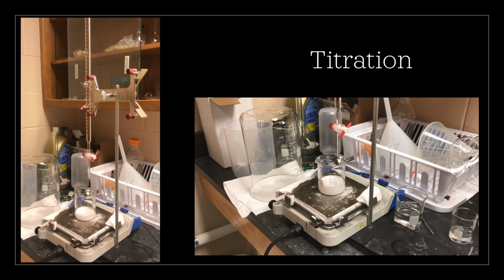But pay special attention to the milky white sample, as the indicator turning pink is more difficult to see.